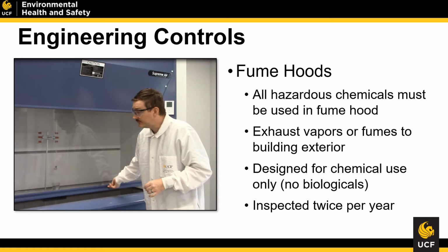If you are using either one of these cabinets, please make sure that they are properly labeled with the appropriate signage for flammables. UCF does have a chemical policy that allows us to store acids and bases together inside of a fume hood as long as they are separated by a secondary containment. There is one caveat to that rule, and that is with nitric acid. Nitric acid has to be segregated into its own secondary containment.